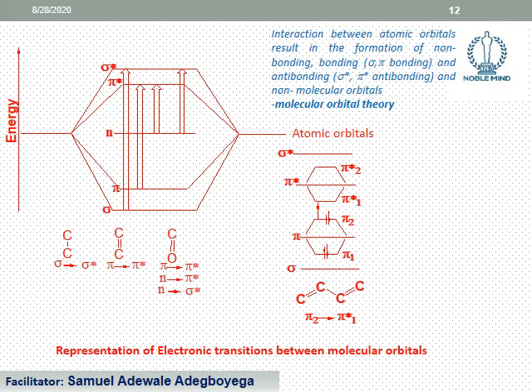So let's look at energy profile. You could see, between carbon-carbon single bond, the saturated bond, we have sigma to sigma star. You can see how wide the energy band gap is between the sigma to sigma star. And you check the one that absorbs with a pi to pi star transition, you see the energy reduces.